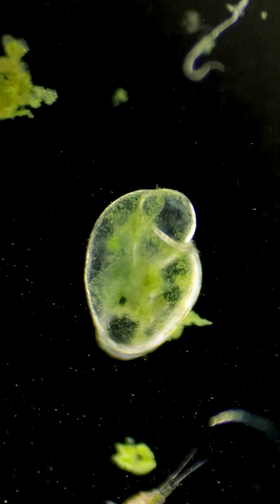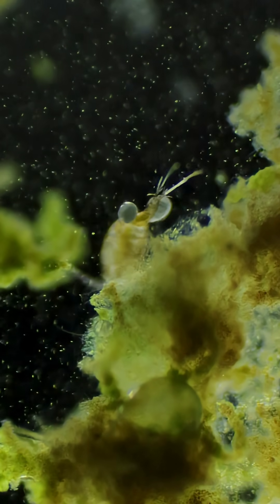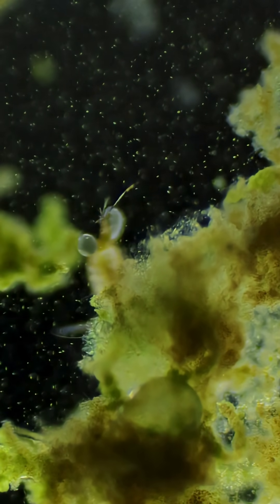One of the old snail shells. I think we found a copepod. Yep, that's definitely a copepod.